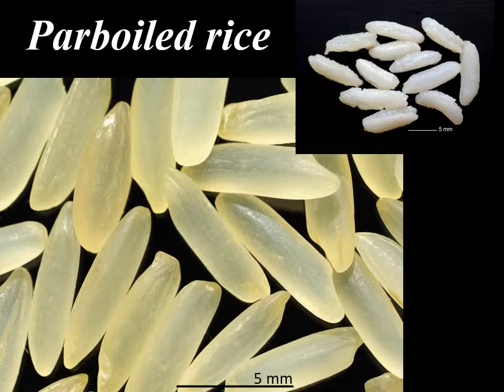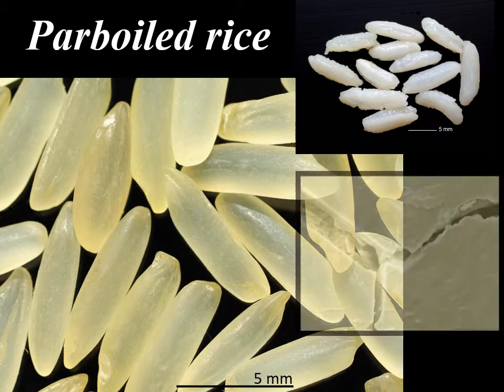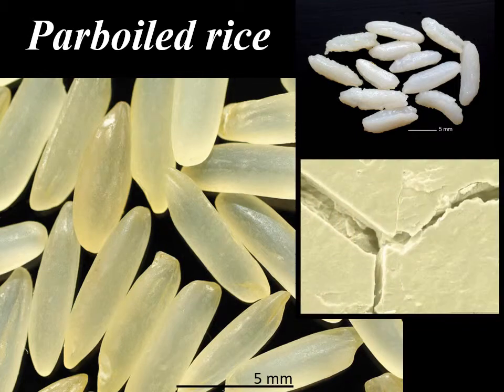Boiling gelatinizes the starch and gives the parboiled rice grain a glassy appearance. No structural details may be observed under an electron microscope.